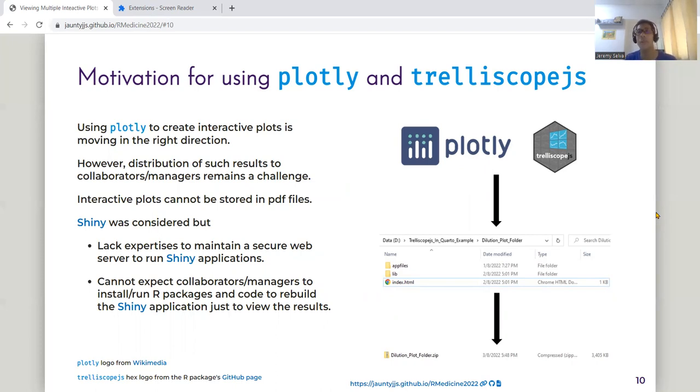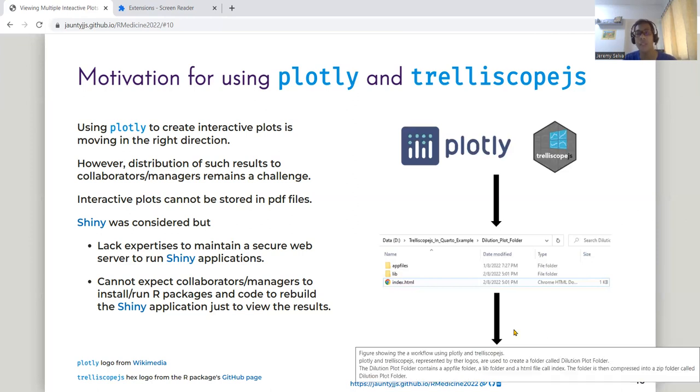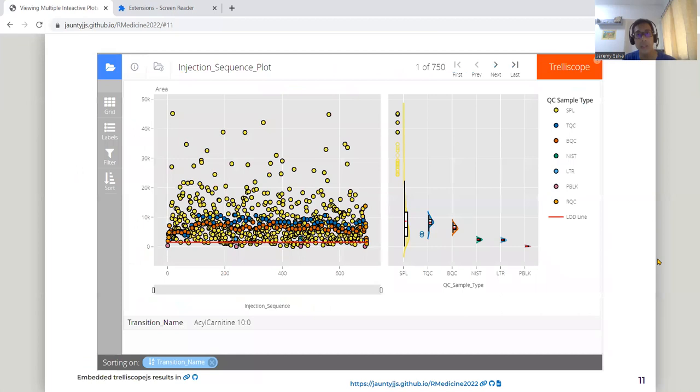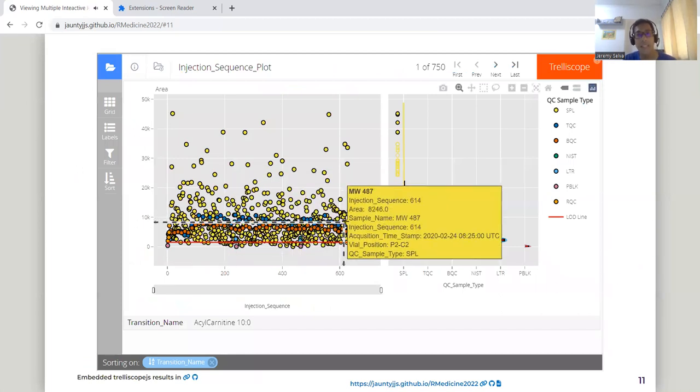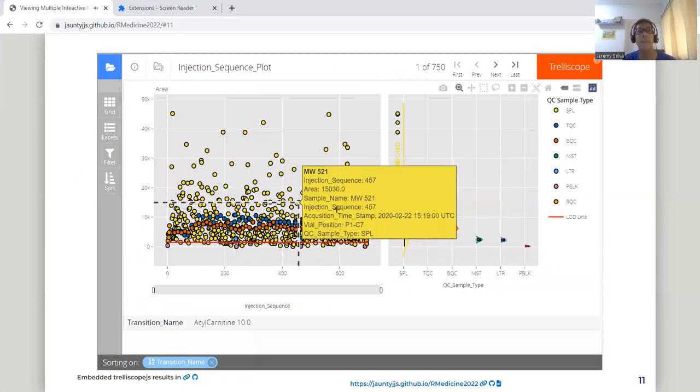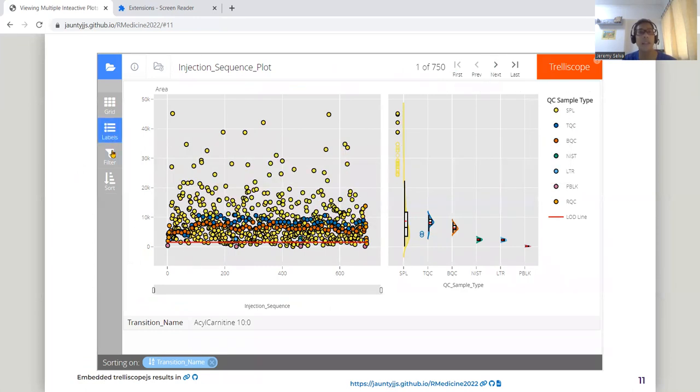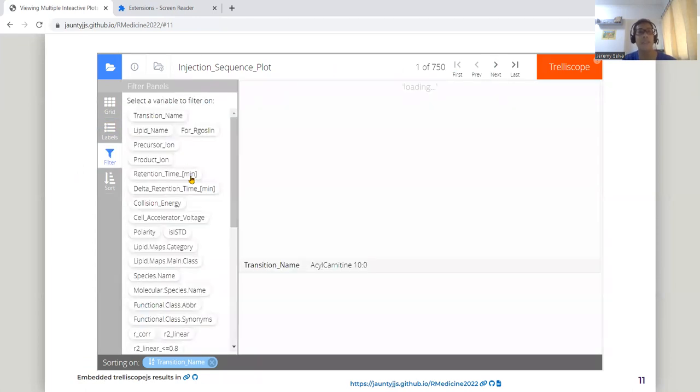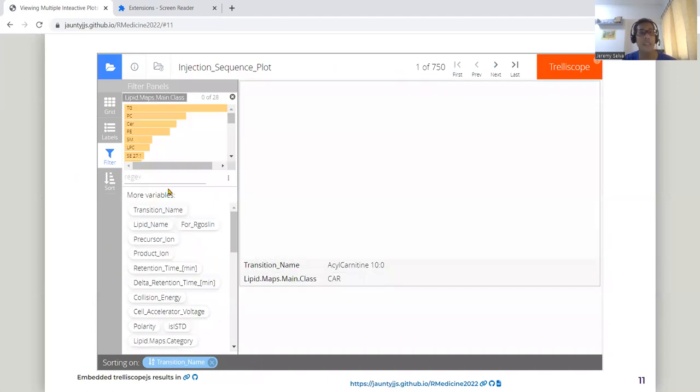Trelliscope.js is able to create these kind of outputs such that I can compress the folder into a zip file and send the data to them. And when they have the data, they can just double click on this index.html file to give a result something like this, where they can see all these plots. And they can also filter them based on their favorite transition classes.